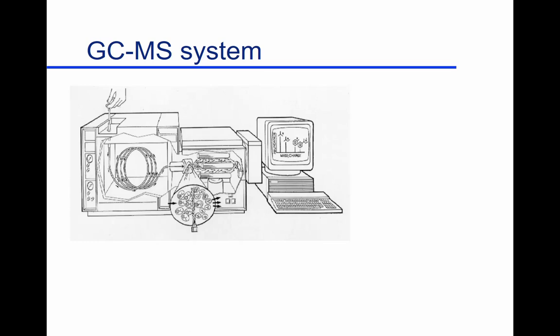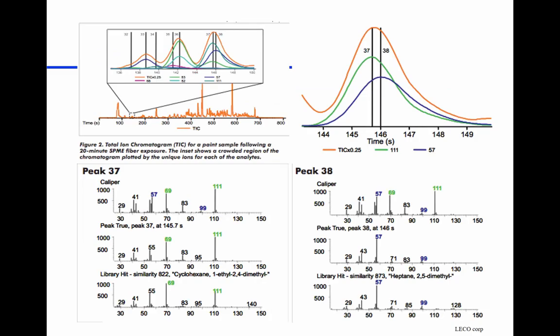So here's our system today. Basically, they're interfaced. Back when the mass spectrometers first came out, they occupied something like half of the table here. If we go down half the row and about that width, now there's something like that wide, that tall, kind of square. So kind of a blessing. So these are really quite small today from what they used to be.